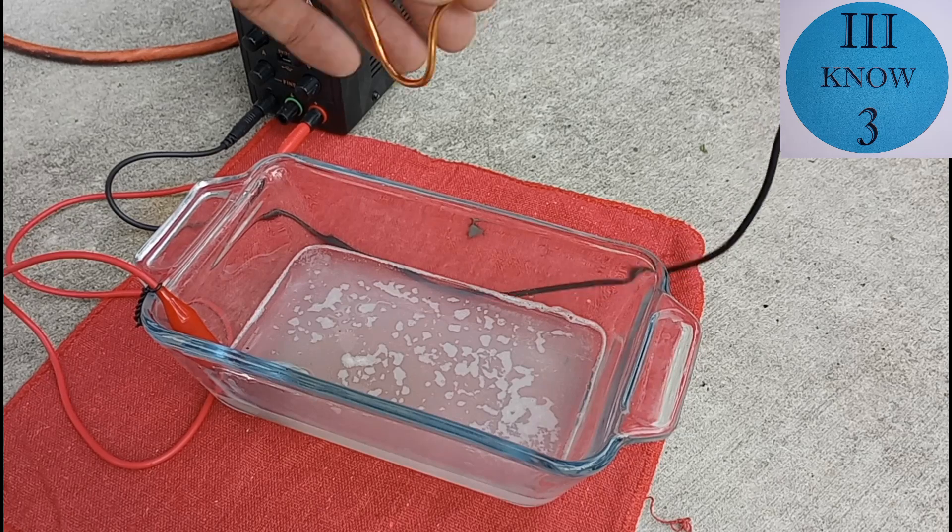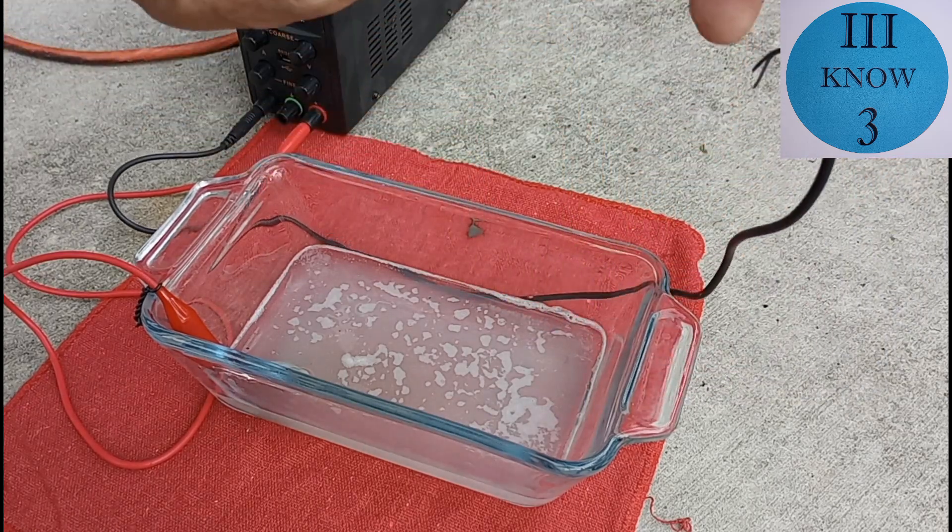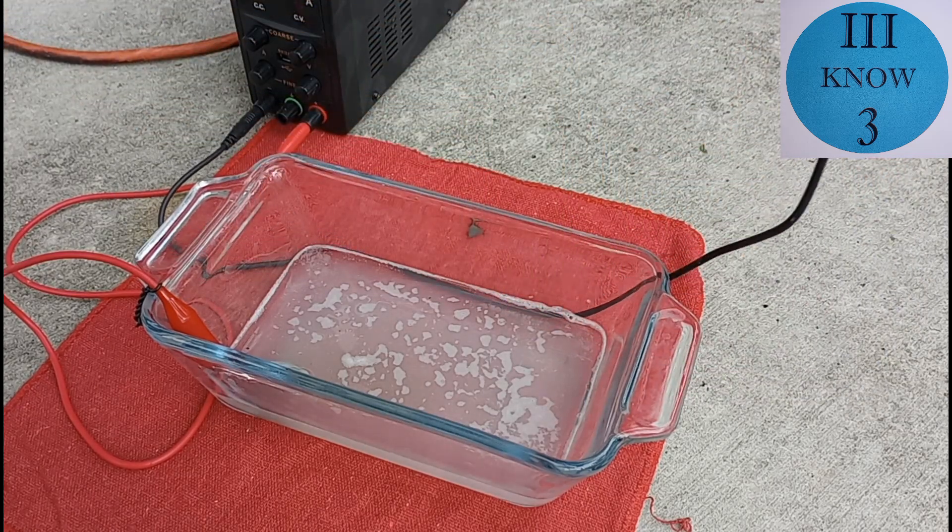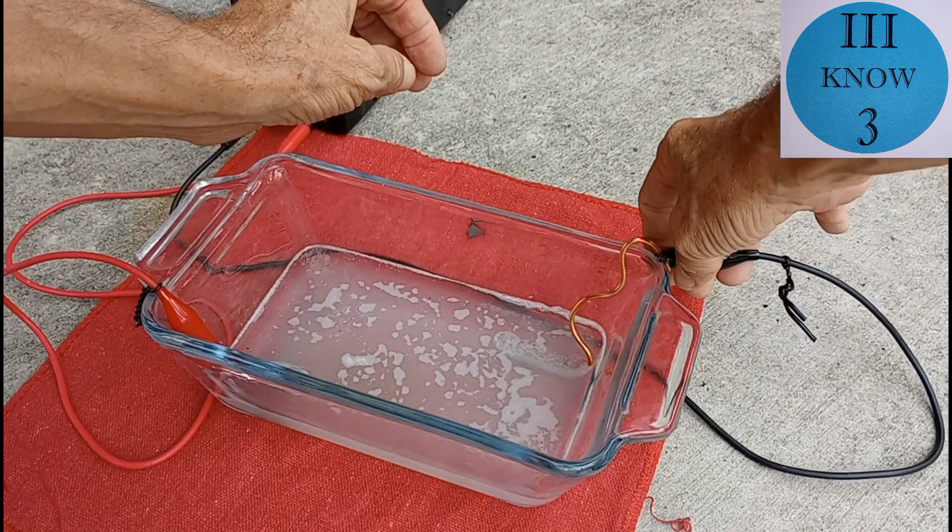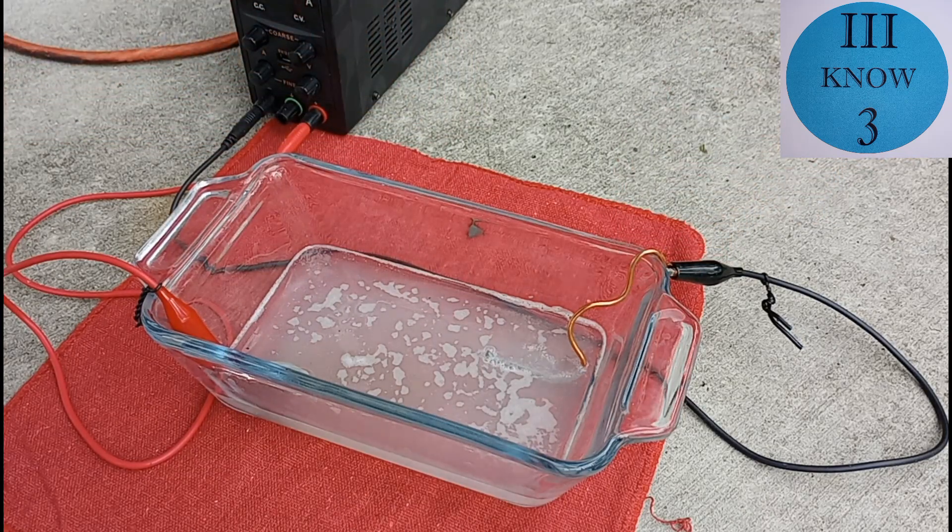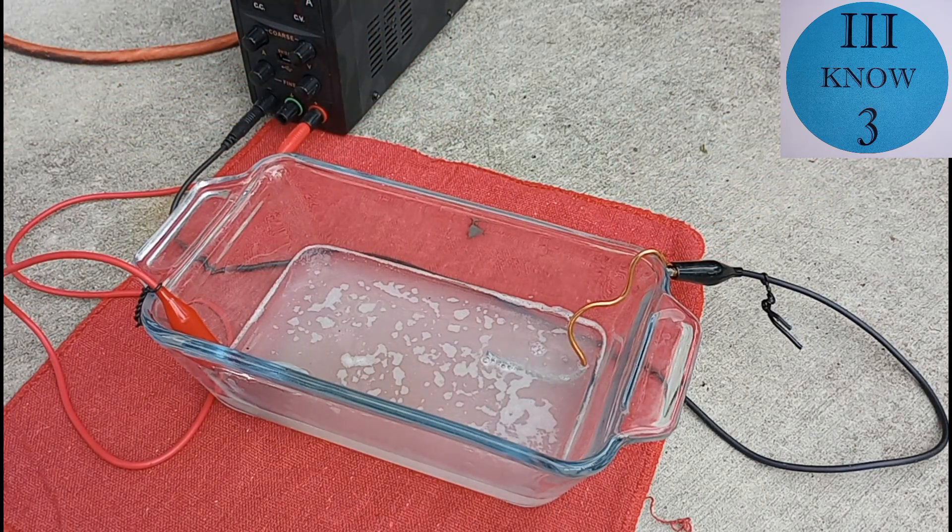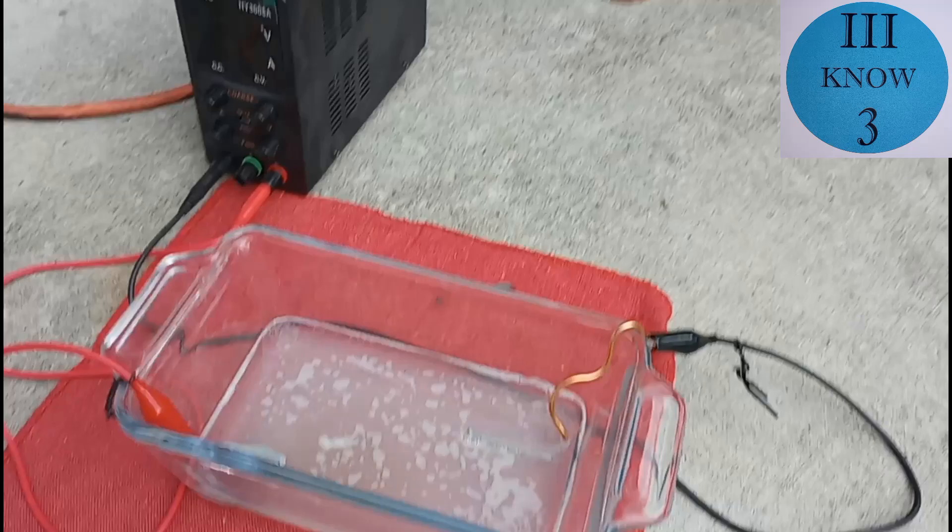So I'm going to switch the cathode from the nickel strip to a copper wire. If nothing else, the copper wire will be more resistant to the hydrochloric acid and maybe we can get some good tin growth on it.